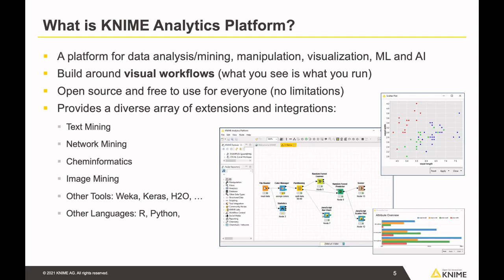KNIME Analytics Platform is a generic, extensible platform. You can access data from many different sources — not only text mining but also image processing. You can load images, do image processing, and join data from different sources, like combining text mining with network analysis and images. KNIME is great at integrating data and tools. It integrates with libraries like Keras, H2O, and you can run Python and R code from within KNIME. You can even execute ImageJ macros on images.